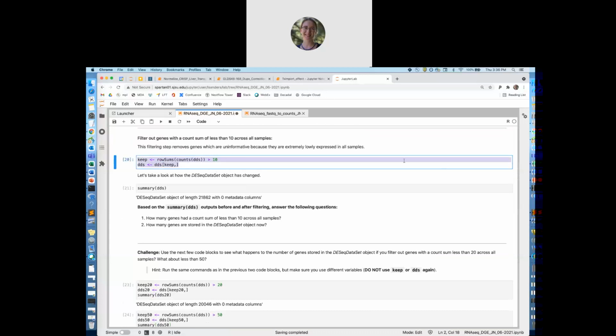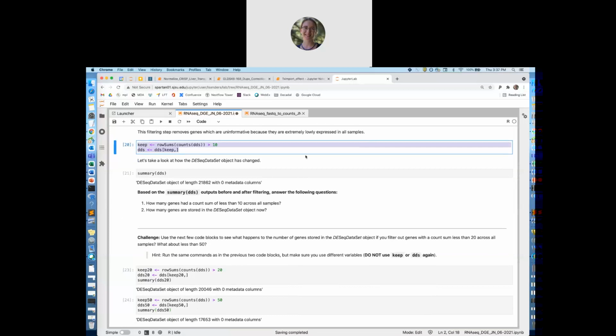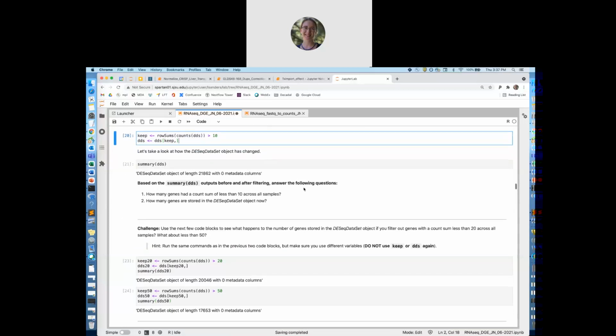That fixed it? Oh, good. So you're getting the same output now, the different lengths now. Awesome.